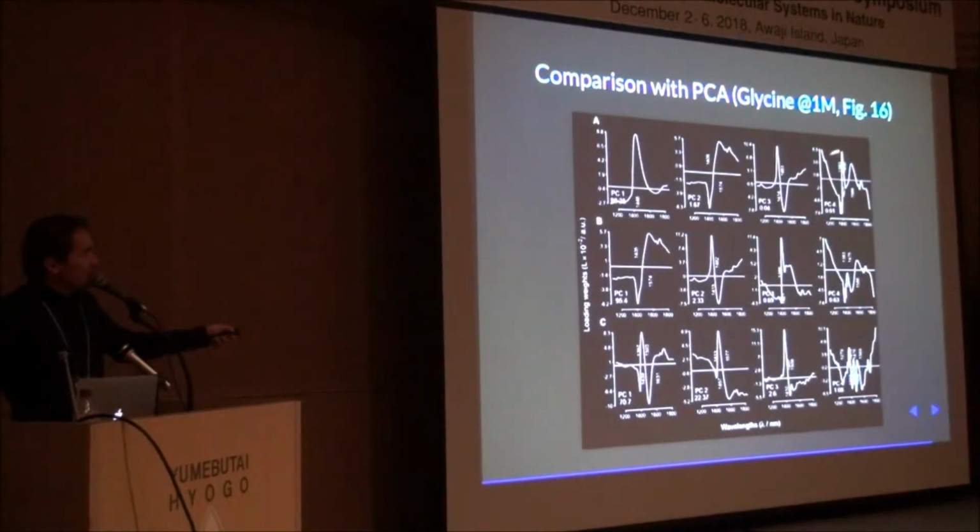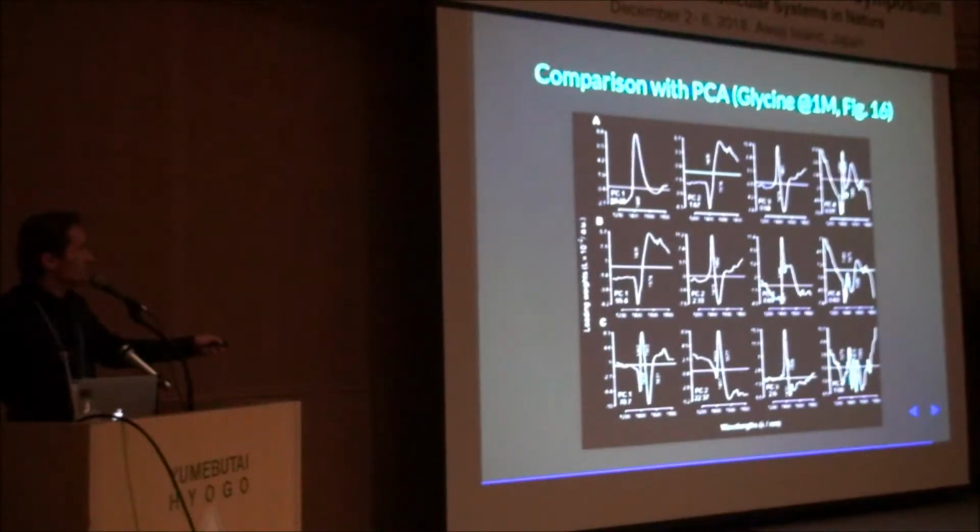And at the last, fourth principal component, you're starting to get something that looks like a band, that looks like a hydrogen bonding description. What happens if we subtract this average spectrum? We get all these principal components shifted one place to the right. So here you get this second principal component, your third is here, and your fourth, you're getting an extra principal component.